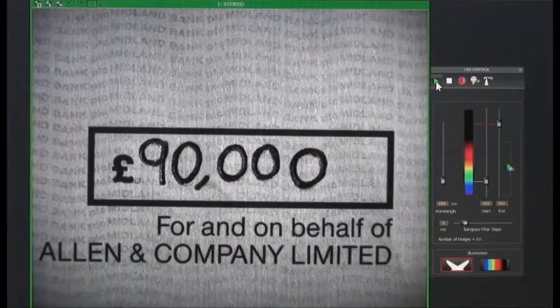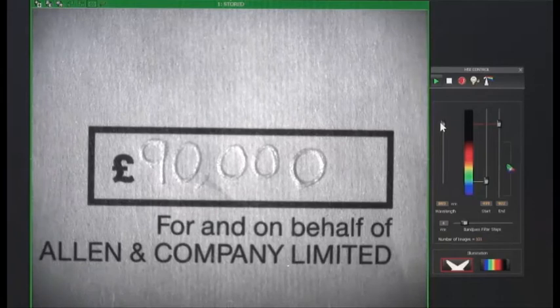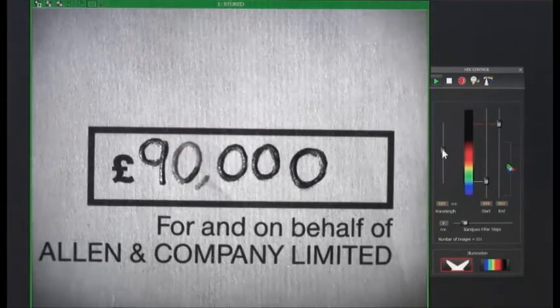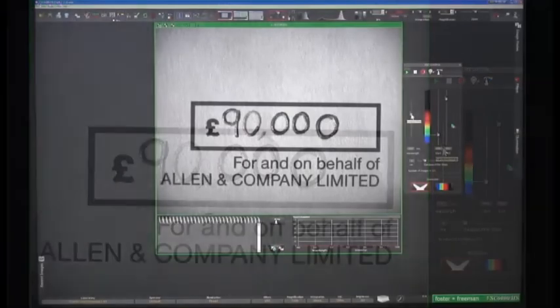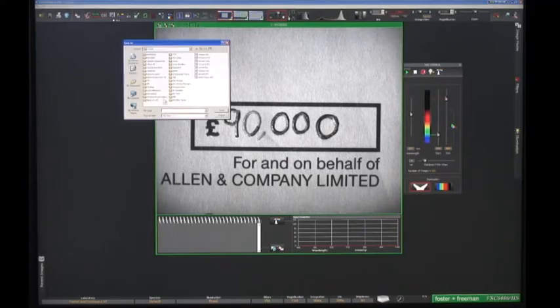If we click Play, the live image is replaced by the first image in the recorded image cube. The wavelength slider is resized to cover the recorded range, and the current image wavelength is shown. We can now adjust the slider to scan through the image cube over the recorded range. We can now save the entire image cube and its parameters by clicking the normal Save button. The file suffix is HSI, and the file size could be up to 180 megabytes depending upon the number of images.